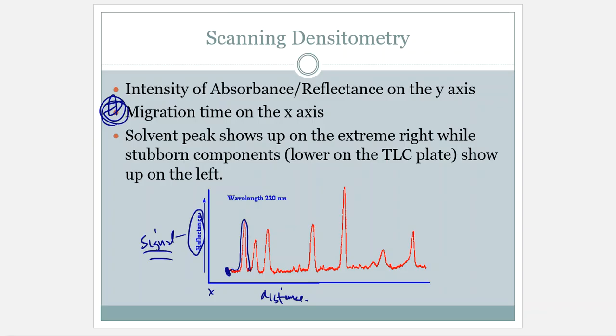And then once it went back down to baseline, there it went. So there is a second spot or a second band on the plate. And then there we go. There's a third spot or a third sample that is picked up in that lane. So we are talking about the same lane. And in that lane, as of right now, we have already run across 3 components that are in that sample that we can visualize, that we can see, that we can image. After that third one, the plate is pretty barren. There's nothing really here, nothing going on. It's flat. And then finally we get another one there again. So I see another spot. I see another band that shows up a little bit later.